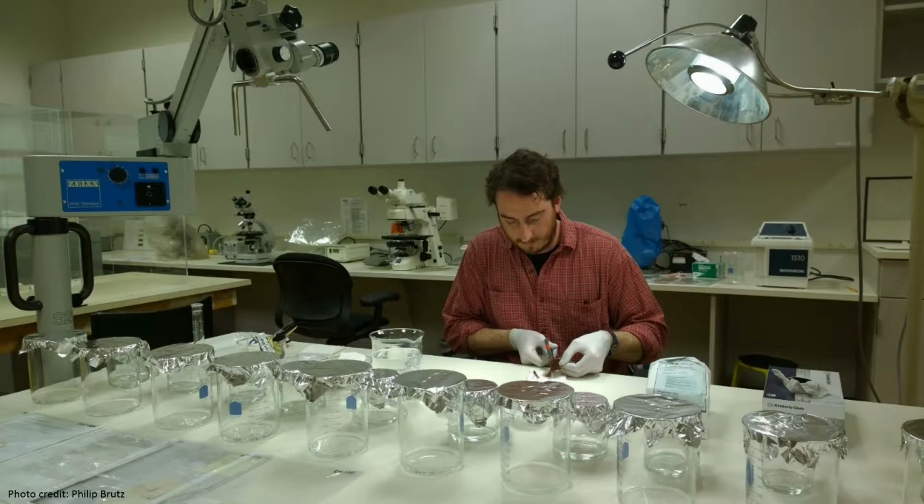So here I am on the home stretch of preparing a batch of Oddy tests last month. Let me explain how I got to this point, because the Oddy test is known for being labor intensive, and I completed a great many steps of test preparation before I got to this point. The Oddy test relies on strips or coupons of 3 types of highly polished metal, being silver, copper, and lead, to detect pollutants emanating from the material sample being tested. The metal should be of at least 99.5% purity.